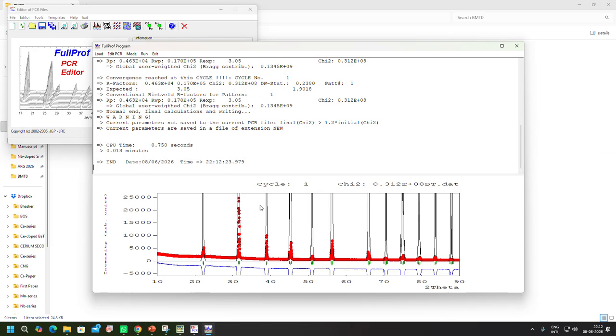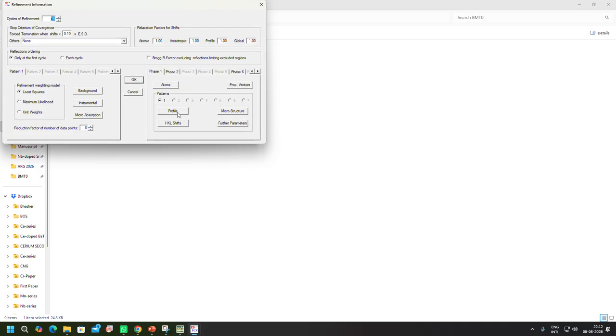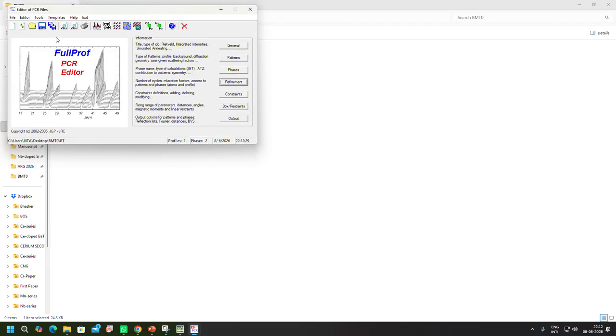so I'm just hiding this. Now one by one you define your process, like first you initiate with the first phase. Okay, alpha, beta, gamma. Okay, and then save. Then you run.